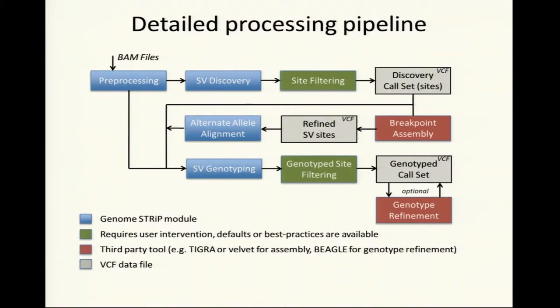You still have to have the pre-processing data, but the VCF can come from anywhere. The input here to genotyping would be another VCF. And then what you would get out is a VCF decorated with all the samples and their genotypes. And then you can optionally, I'll talk just a little bit about doing genotype refinement by using LD structure in the human genome.